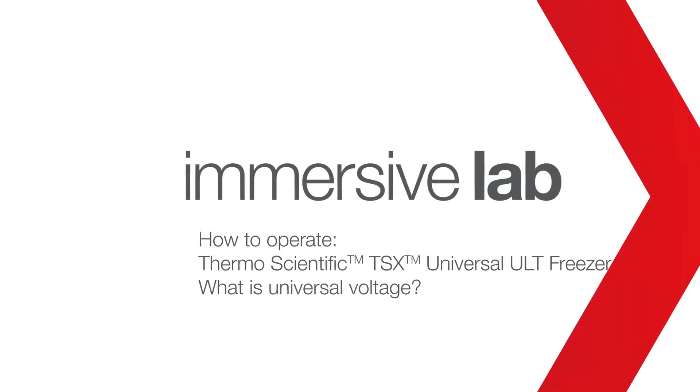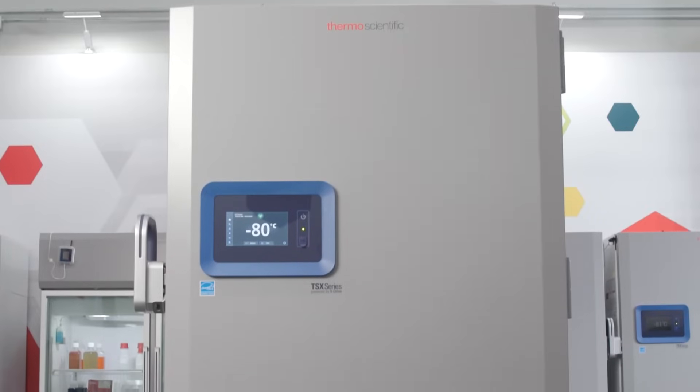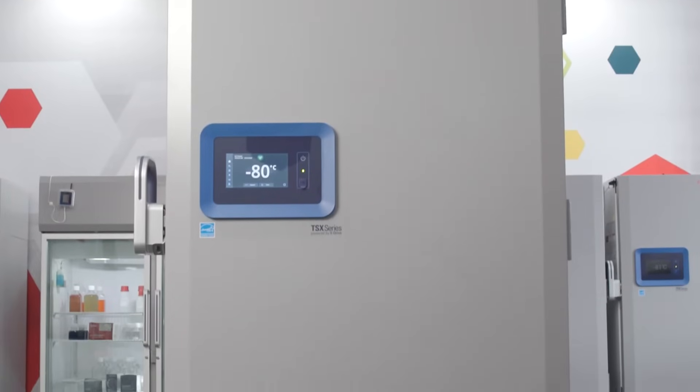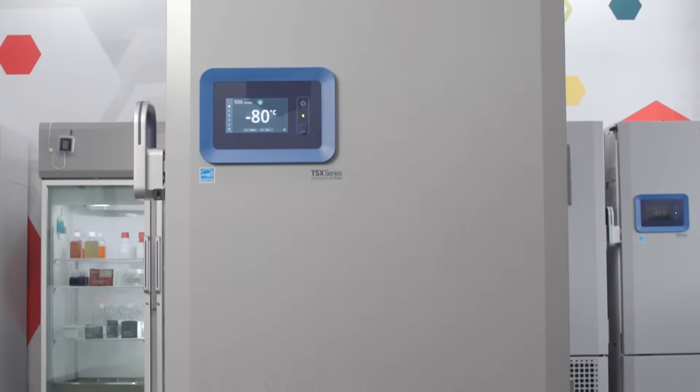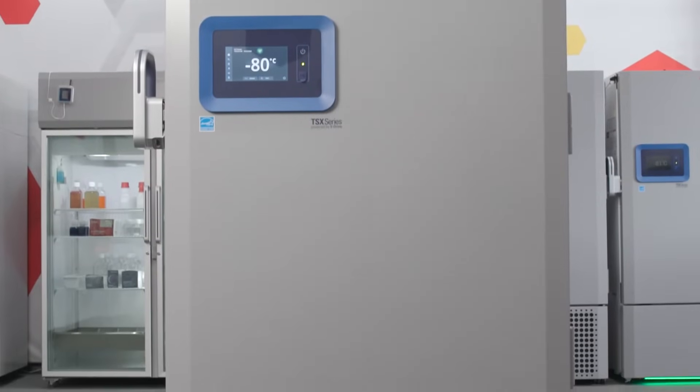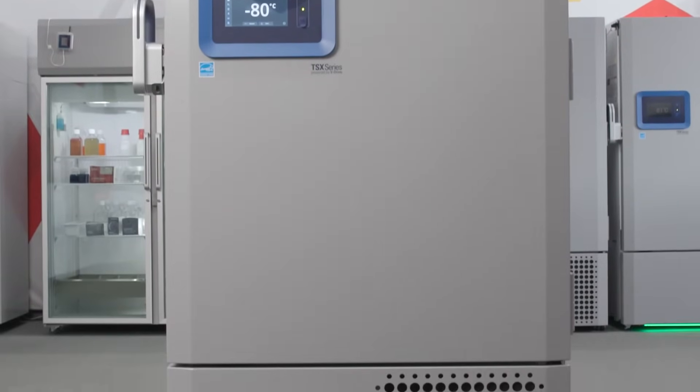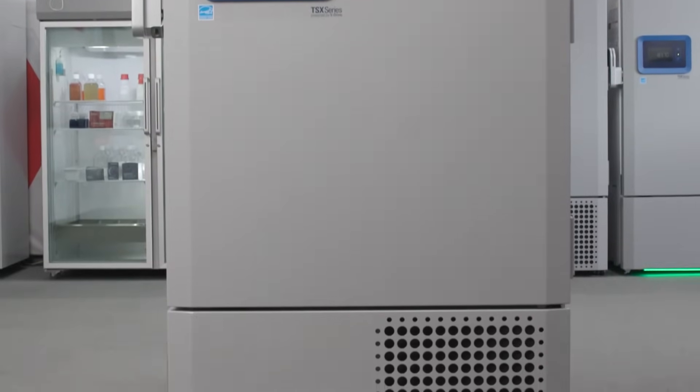Hello, in this video we'll show you how easy it is to power up your Thermo Scientific TSX Universal Series ULT Freezer.